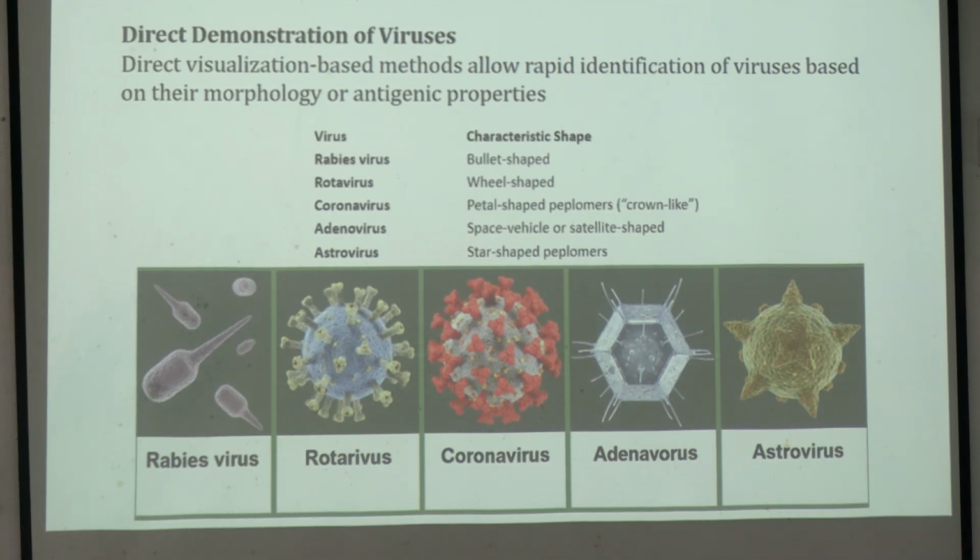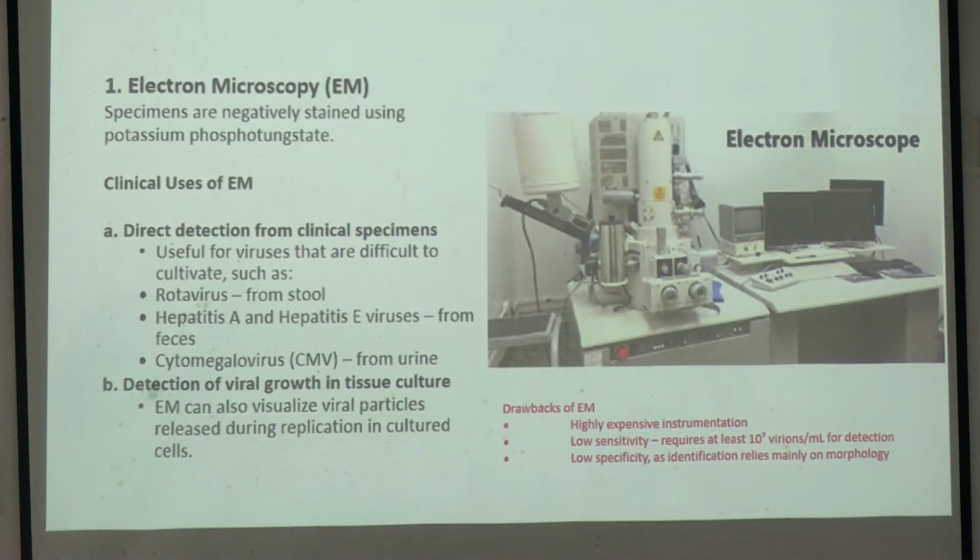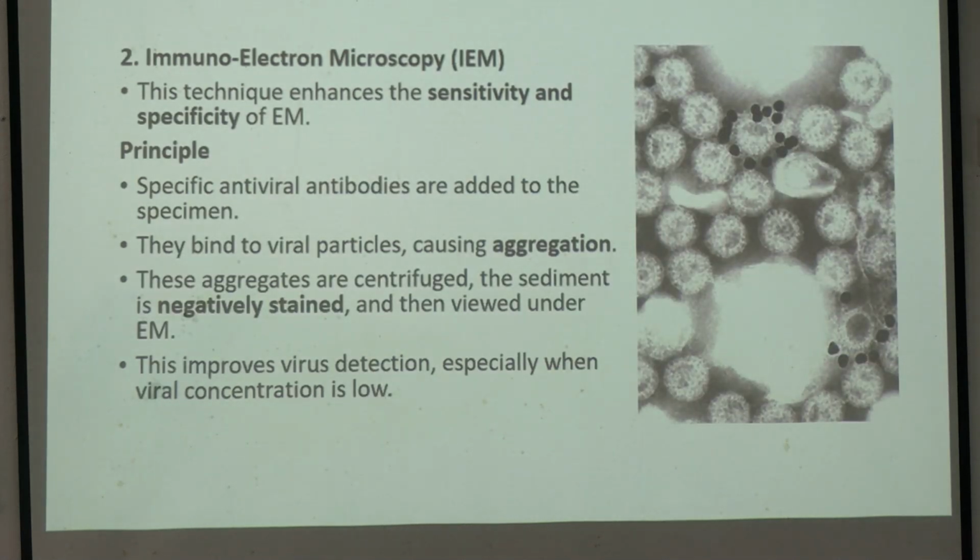So, it is used for research purposes. It looks like this, it is a huge machine and it has n number of drawbacks, but yes, the magnification is so high that you can see the viruses. So, that is the advantage.